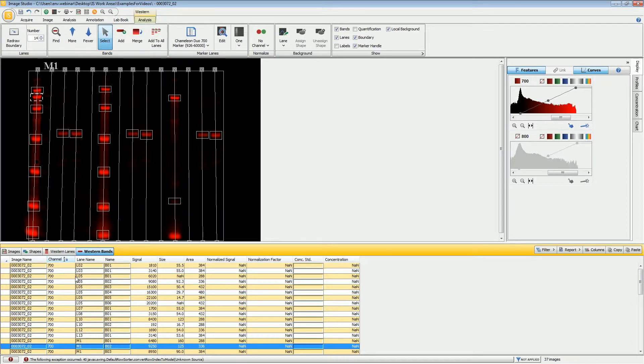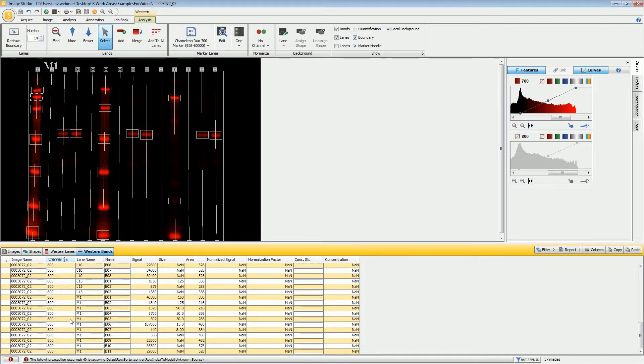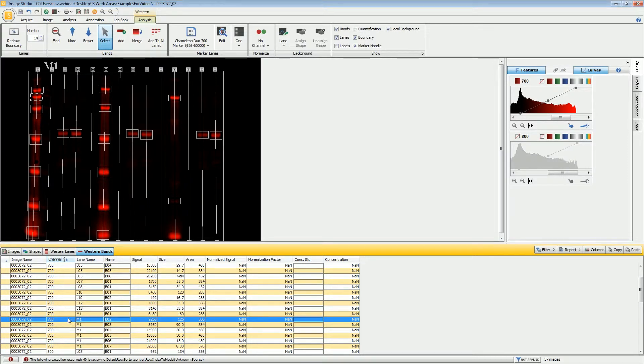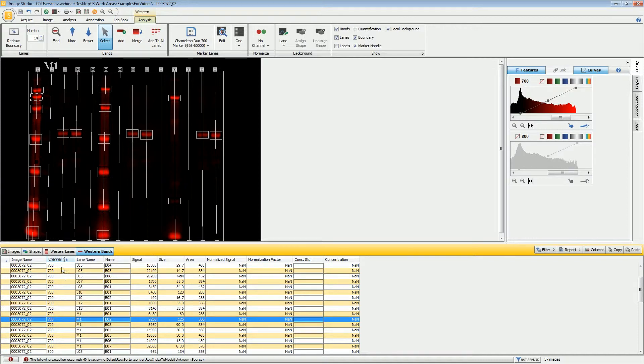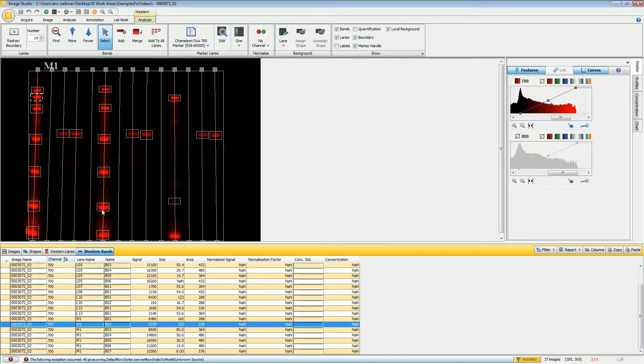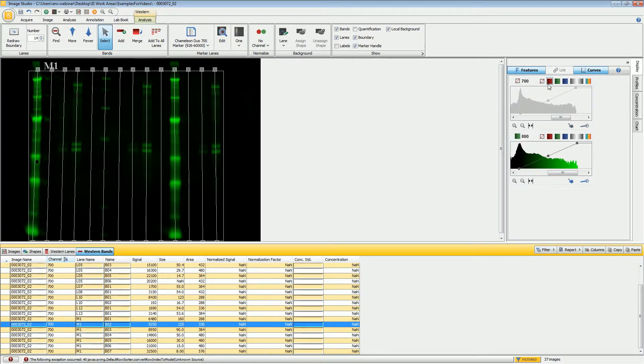Once I have that designated, I also need to make sure that I turn off or hide all of the 800 bands. Because since the 800 will be using a different marker, they will not be sized correctly if I don't hide those. The way that you do that is to right click on the channel header and hide the 800 bands. Those are not shown here.